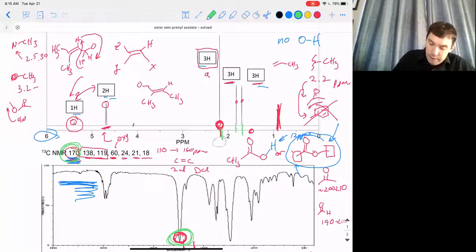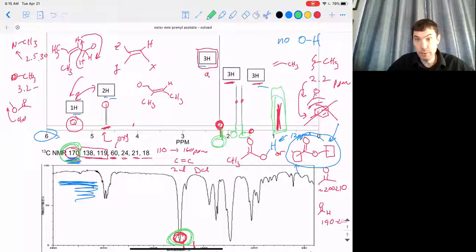And it's very cool that we can take advantage of this chemical shift information and recognize that they're not your standard old methyl carbons. Not only that, they're definitely not where we'd expect esters to be or ethers to be. And so because they're upfield of those, we know from that chemical shift information that they're not directly bound to an oxygen. And that really helps us propose that they're the acetate as well as the allylic methyl groups.